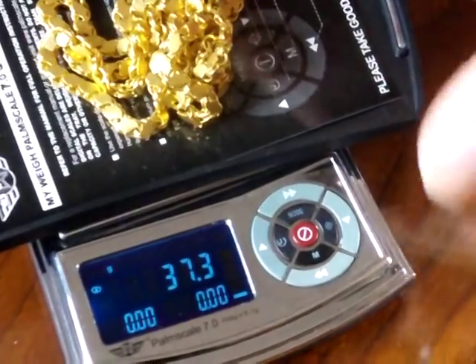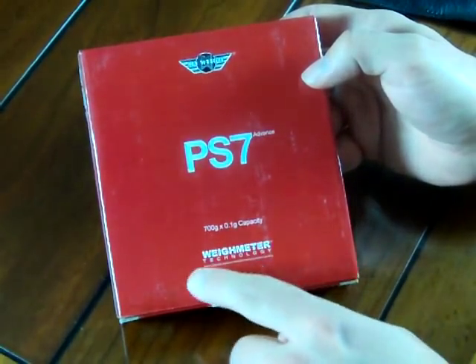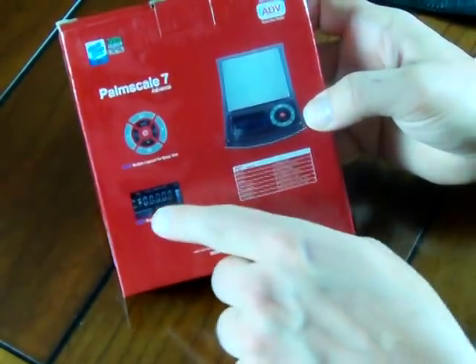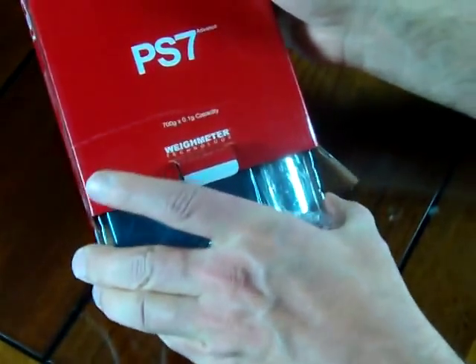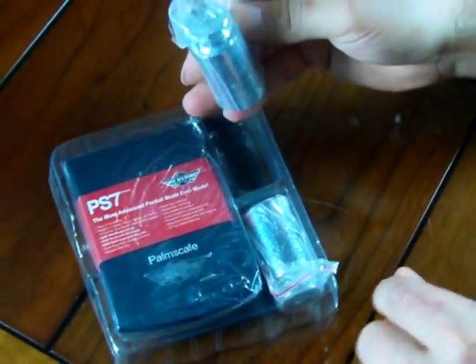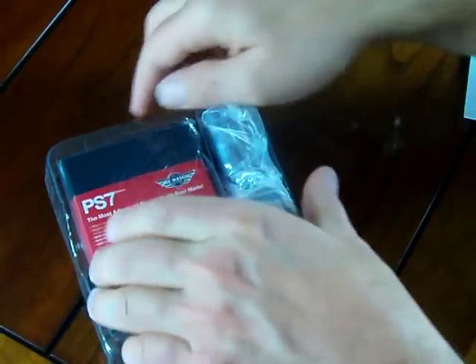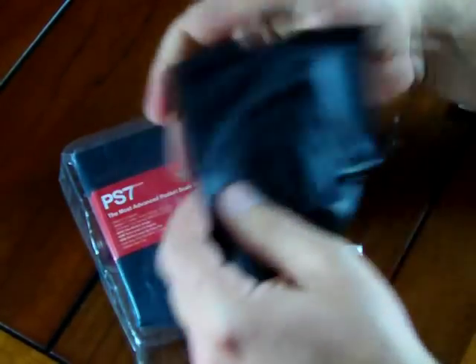I wanted to show you how the scale comes packaged. MyWay does a great job with all their packaging — they have their logo, the MyWay PS7, their trademark technology, and their weight meter. On the back of the box it shows the scale, the LCD, the keys, and the specifications. When you open up the box, the scale comes very professionally packaged. On the 700 gram unit, you'll see there are two 250 gram calibration weights. You also have the scale itself, a user manual, and a vinyl pouch for the scale to go in. So this is what comes with the PS7 700.